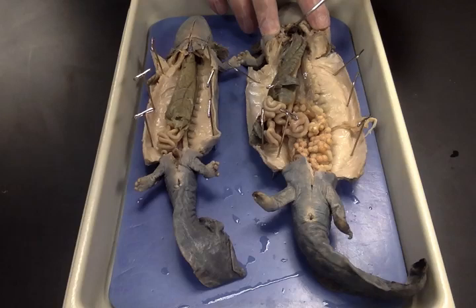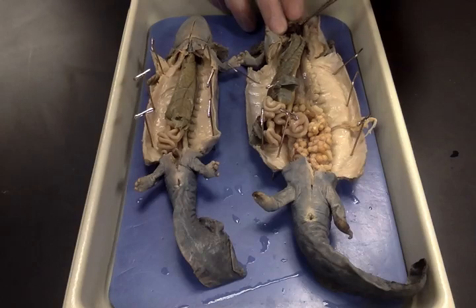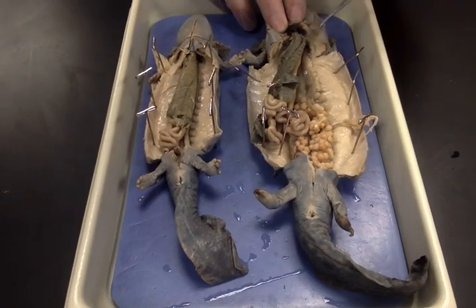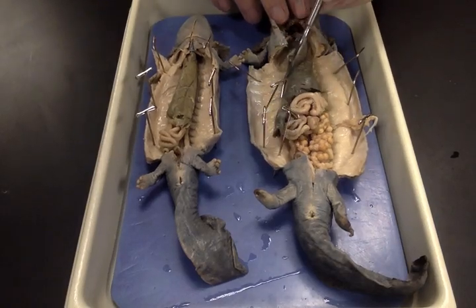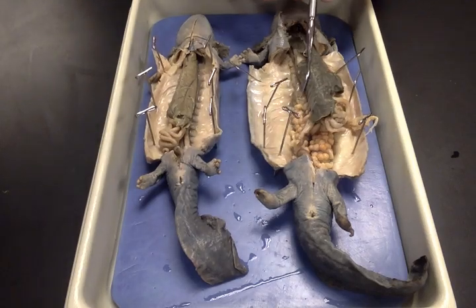Way up in the neck is the heart. Remember, it's a three-chambered heart — it mixes the blood so that after it goes to the gills, it comes back to the heart and is mixed before it travels to the body. And that takes care of mud puppy anatomy.